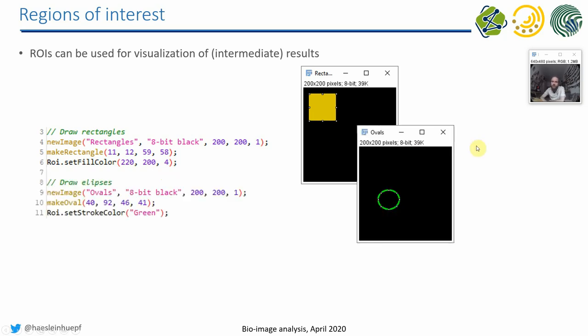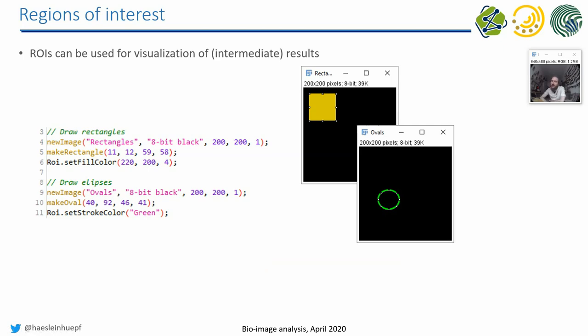Furthermore, we can also change the stroke color of our ROIs in order to make it a green outline. What we can unfortunately not do with one particular ROI, we cannot set the fill color and the stroke color. So it will always just do one of both. Either an outline with a different color, or it's filled with a certain color. Both at the same time is unfortunately not possible.